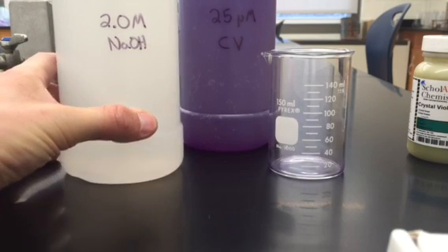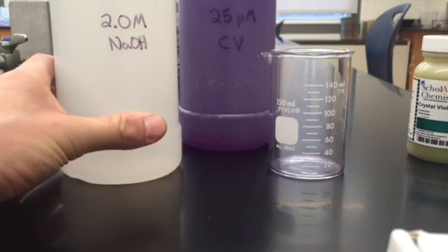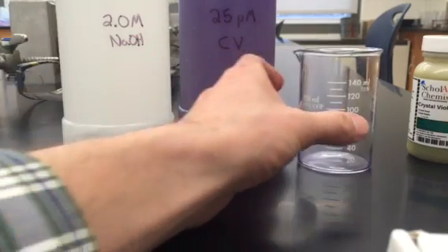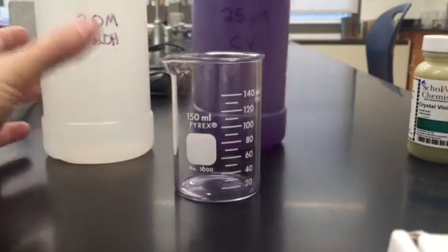I'm using a heavily concentrated version of sodium hydroxide compared to what we will use in lab, and this is simply a demonstration of the reaction itself to show the crystal violet fading.